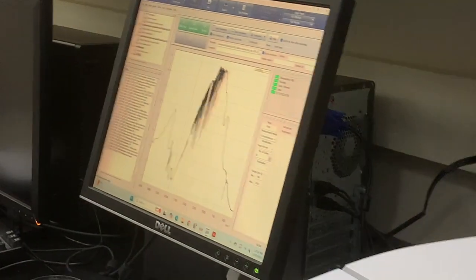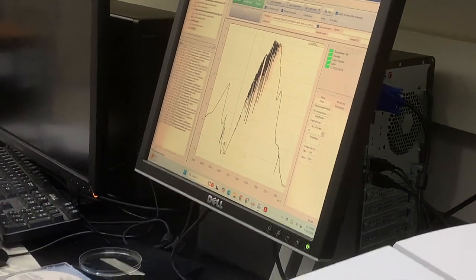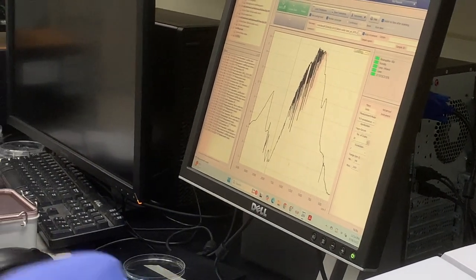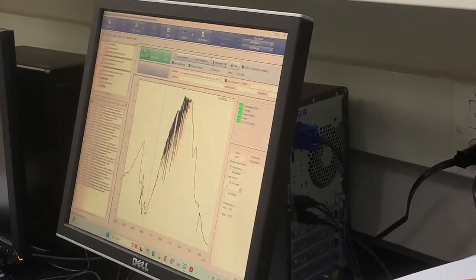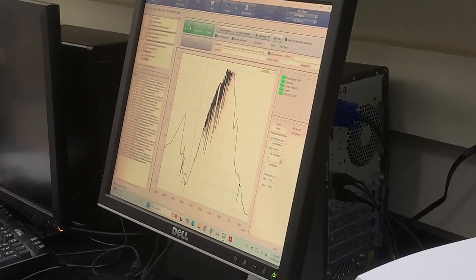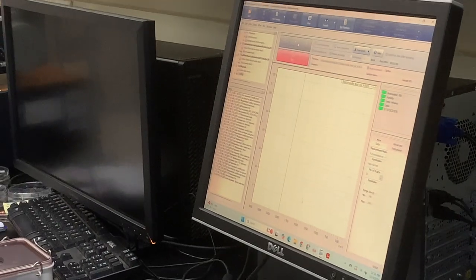Okay, for the sample, I don't care. I have a lot of samples, but I don't want to cause any damage to the crystal itself. It shouldn't damage the crystal on the ATR. Oh no, it's a diamond crystal. It's fine. That's fine. We can try that right now and apply more pressure. Sample scan. It's time.